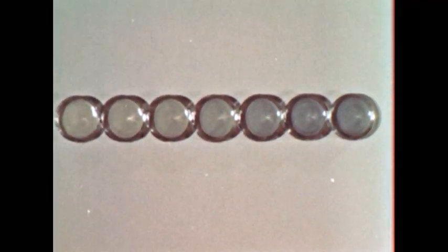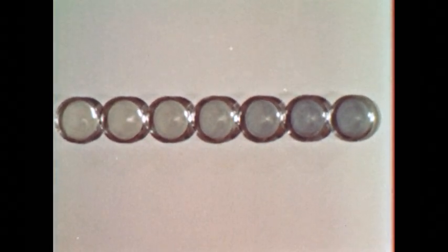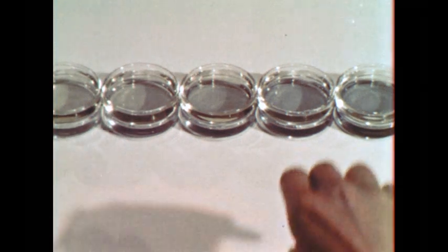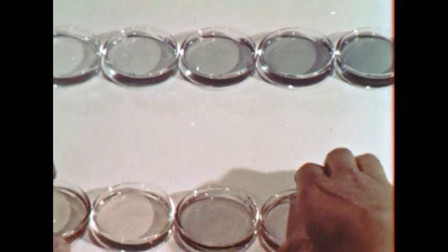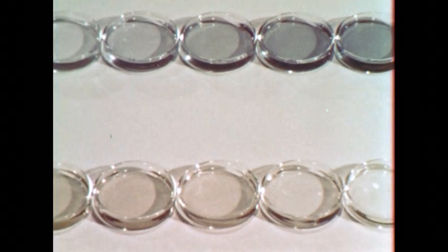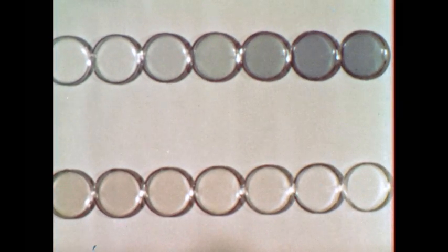Here, arranged in petri dishes, is a set of solutions to which bromothymol blue has been added. The colors change gradually from yellow to blue. Actually, there are two sets of dishes. All of one set are yellow, all the others blue. The solutions in the yellow dishes are all equally acidic.